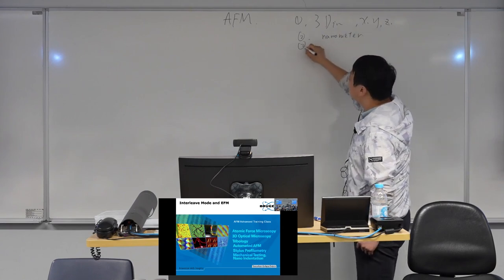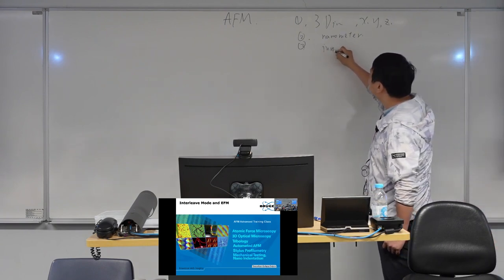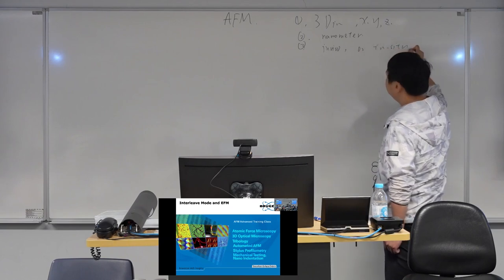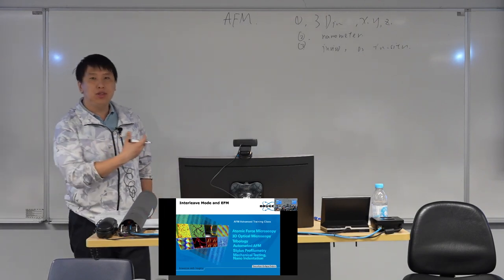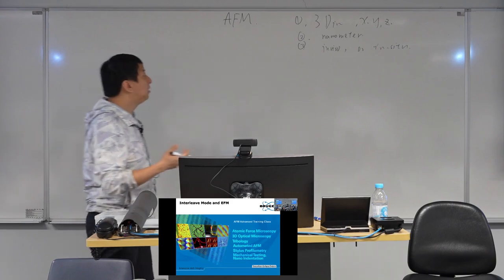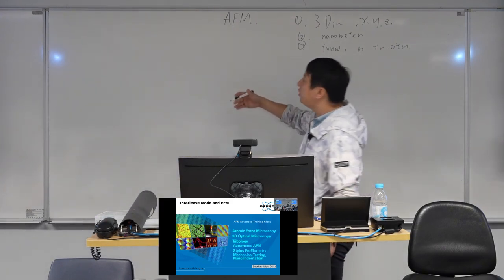And third, if we can get it done in vivo or in situ. Those are the three goals we want to achieve using the atomic force microscope.